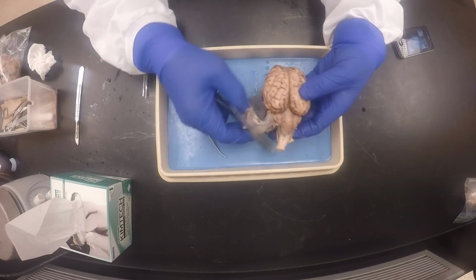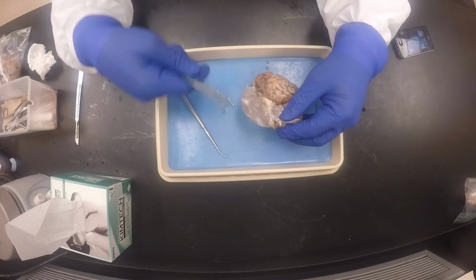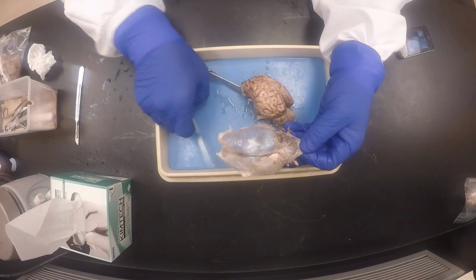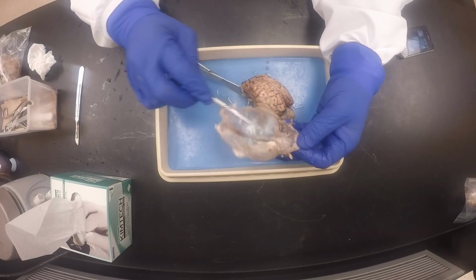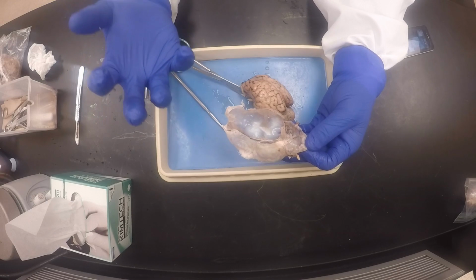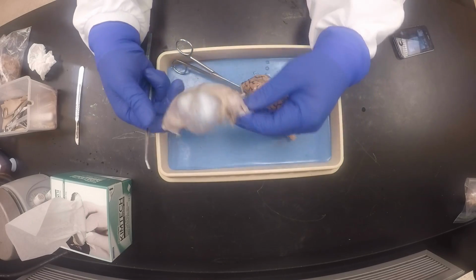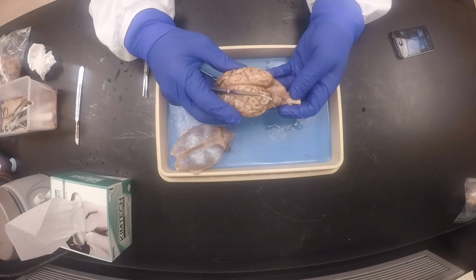Do you see how hard this is? When you guys cut through yours, you're going to see how hard that is. So we've removed the dura mater, and there it is. Falx cerebri, tentorium cerebelli. This is really hard. It almost cradles the brain like that to support it, so it's a good support. We remove that, and then, voila, our brain.